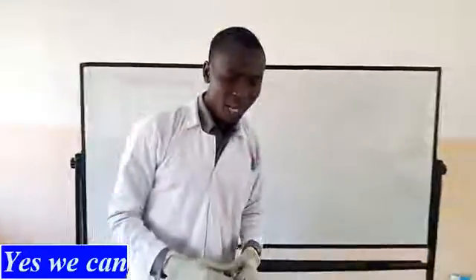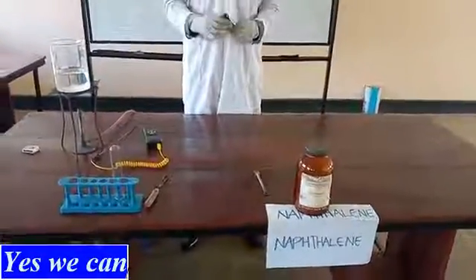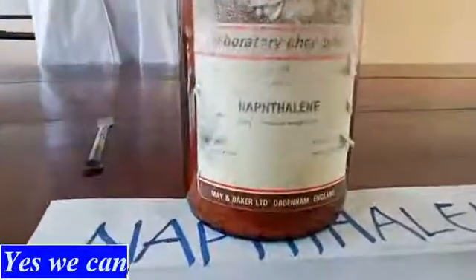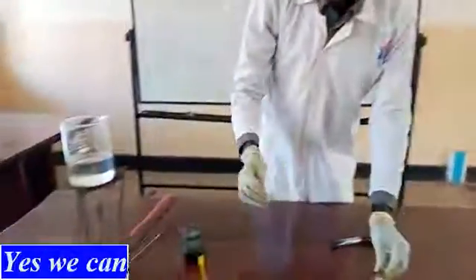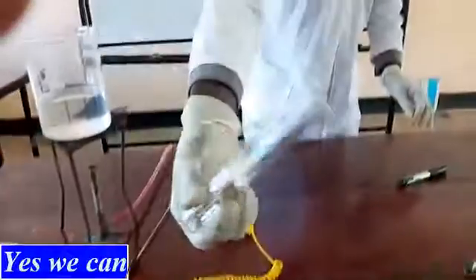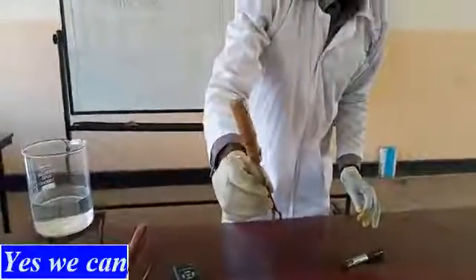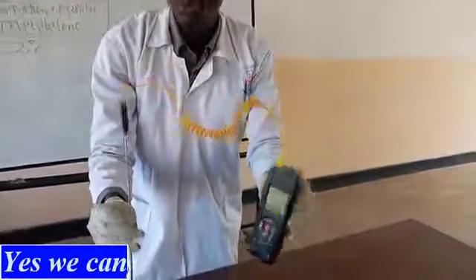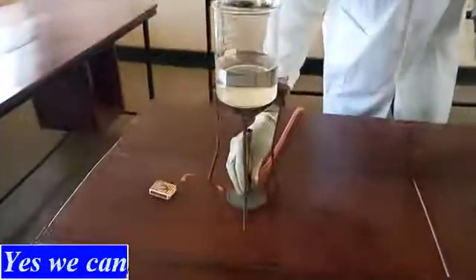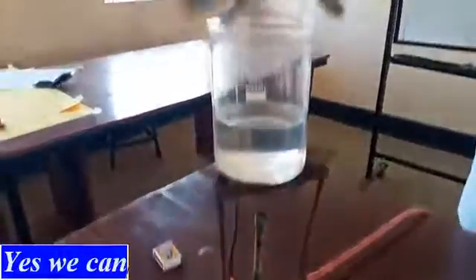We have here the apparatus we are going to use to determine the melting point of naphthalene. We have the naphthalene itself, which is a solid. We have a spatula, a test tube rack, a boiling tube, a test tube holder, a digital thermometer, a Bunsen burner with a wire gauze and tripod stand, and a beaker containing water.